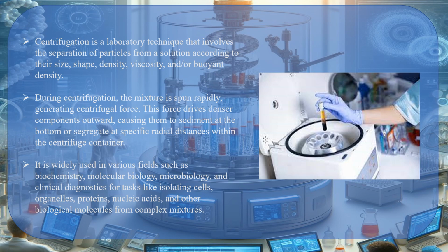It is widely used in various fields such as biochemistry, molecular biology, microbiology, and clinical diagnostics for tasks like isolating cells, organelles, proteins, nucleic acids, and other biological materials from complex mixtures.